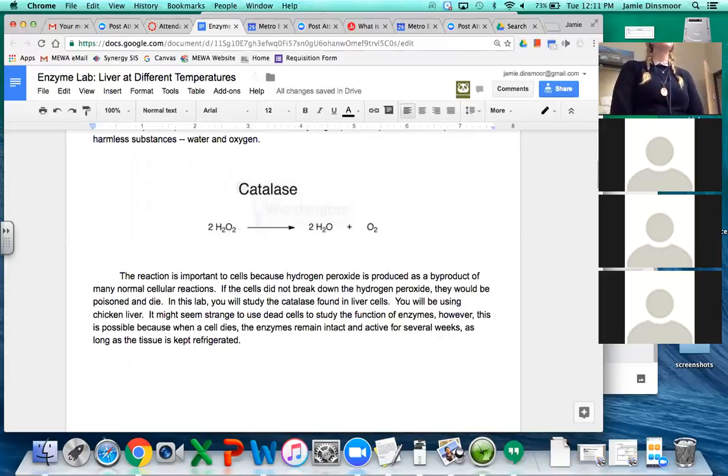Those are the only guesses. We're all agreeing. Is your body room temperature? No, right? But was I right? We'll see. Okay. I'm not going to give it away.